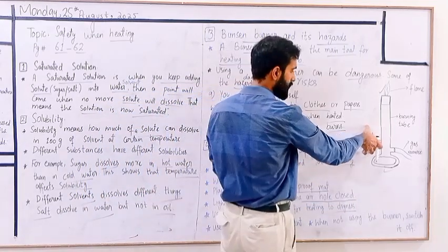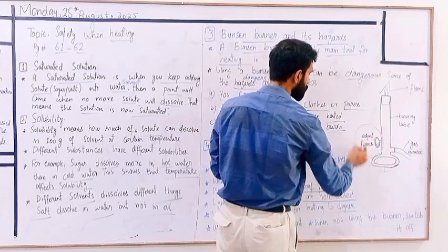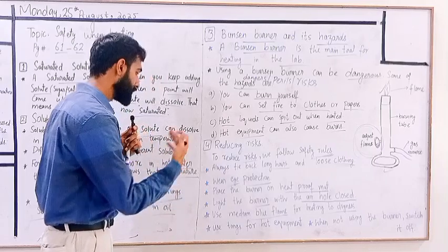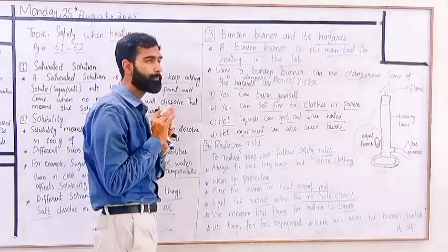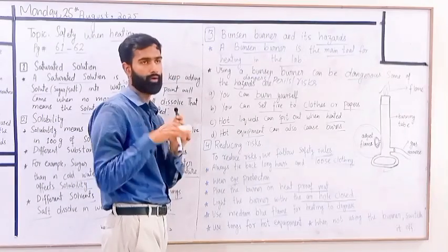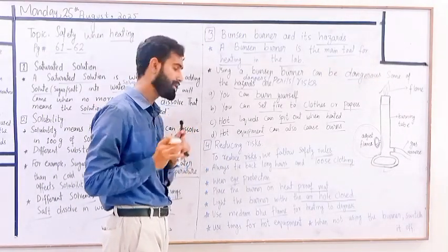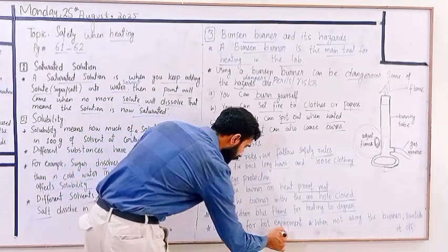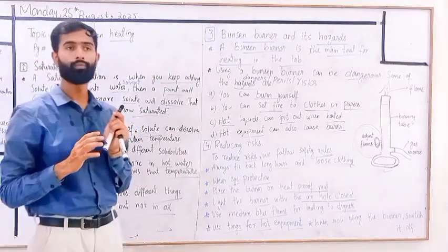That is the part, also known as the air hole. So light the burner with the air hole closed. Second last, use a medium blue flame for heating. Always use tongs for hot equipment.